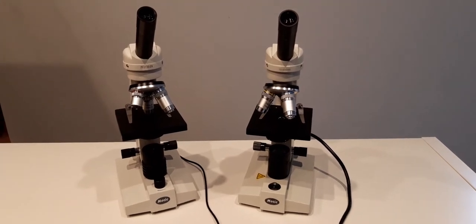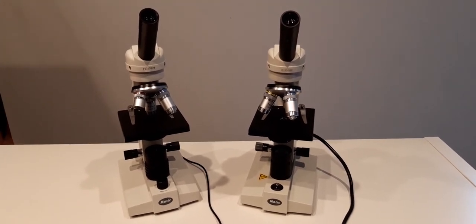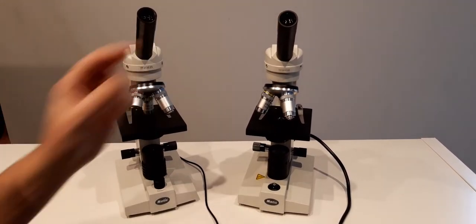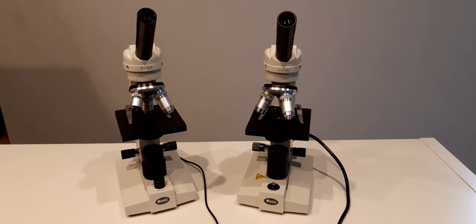Starting from the top we have a 10 by 18 millimeter wide field eyepiece which gives a nice flat field of view. Both contain a pointer.